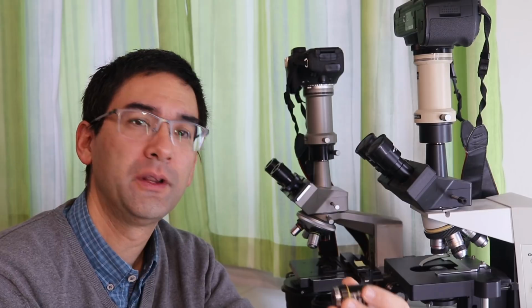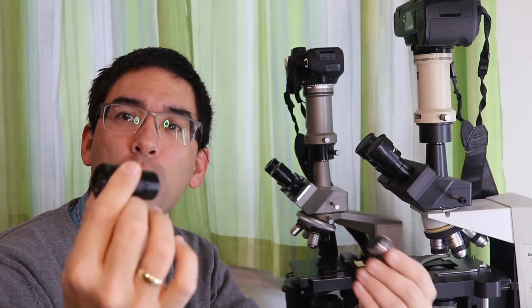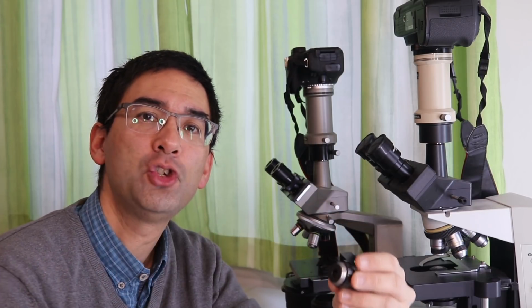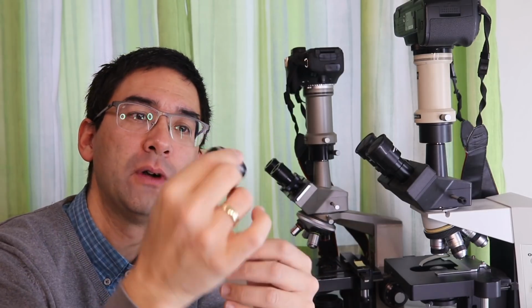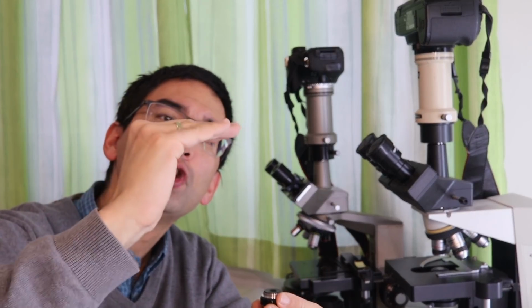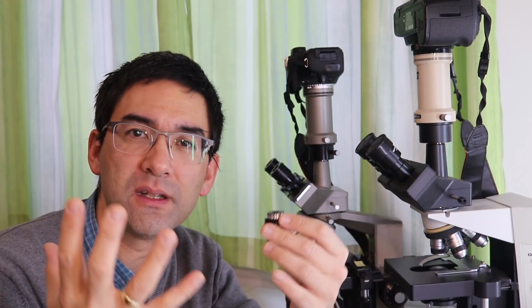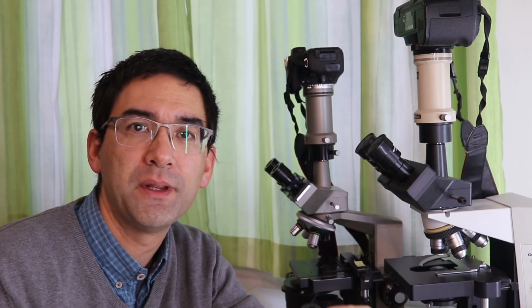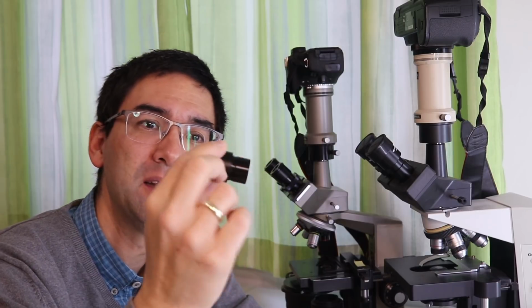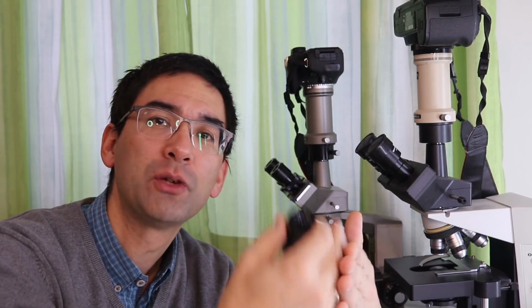Okay, so first of all, there are different types of microscope eyepieces, but all of them have one thing in common, namely they magnify an image that was projected by the objective. If you have a microscope objective here and you're looking at a specimen, then this objective will project an image into the tube of the microscope. You cannot really see this image directly, but if you were able to place a sheet of paper into the tube, then you would be able to actually see the image projected on this sheet of paper. Obviously we don't have a screen inside the tube of the microscope, but there is the eyepiece, and this eyepiece will now magnify this image that was projected.